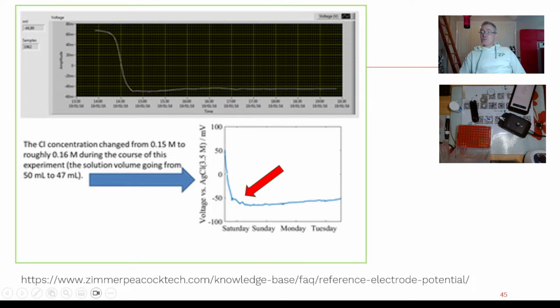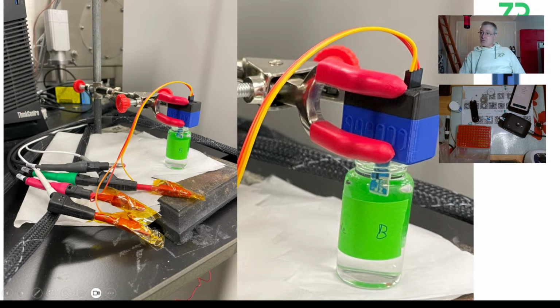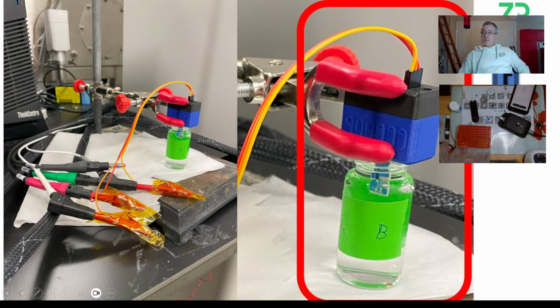When I look at your experimental setup, I'm certainly not critical of these people, because they know how to present their science, they know how to tell me the story, which makes my life easier, including the good quality images. But the beaker is open, there's no temperature control, there's no temperature logging here. So I can see a few things: it's not necessarily sealed. You will get evaporation over the course of those days. You've also got the possibility of exchanging gases with the atmosphere as well.